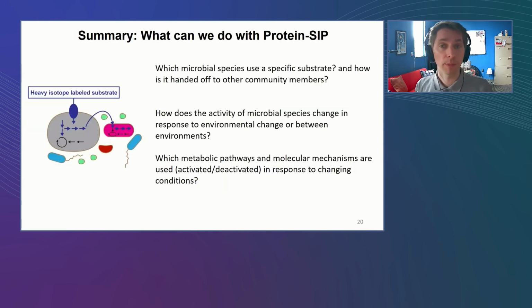And with that, I would like to sum up my talk. I hope I was able to share some of the excitement about this new method that really should allow us to do all kinds of different experiments in microbial ecology. So using ProteinSIP, we can now address questions such as which microbial species use a specific substrate, and how is it handed off to other community members?